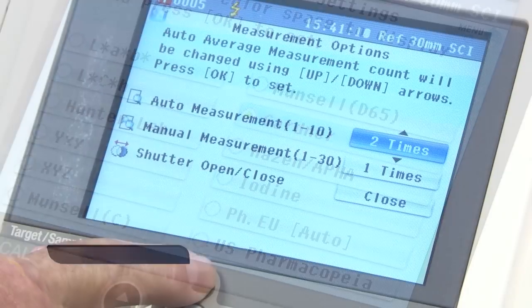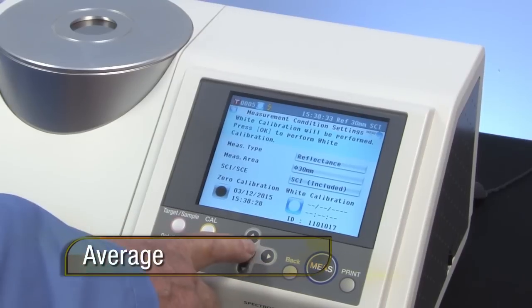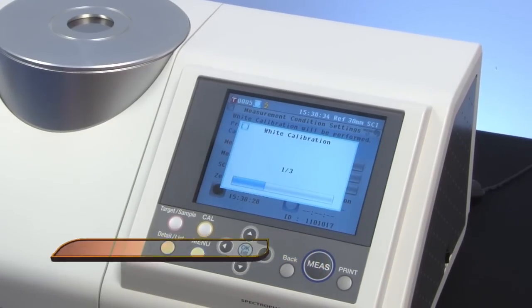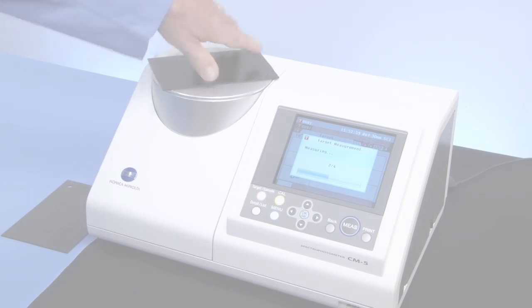The CM5 has an average measurement mode for textured materials. Calibrate, set the auto measurement, and turn the sample while automatic measurements are being taken. This setting is also used with color difference.